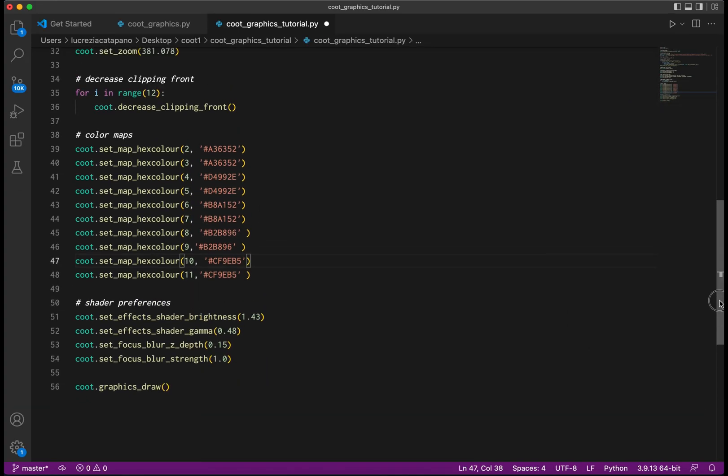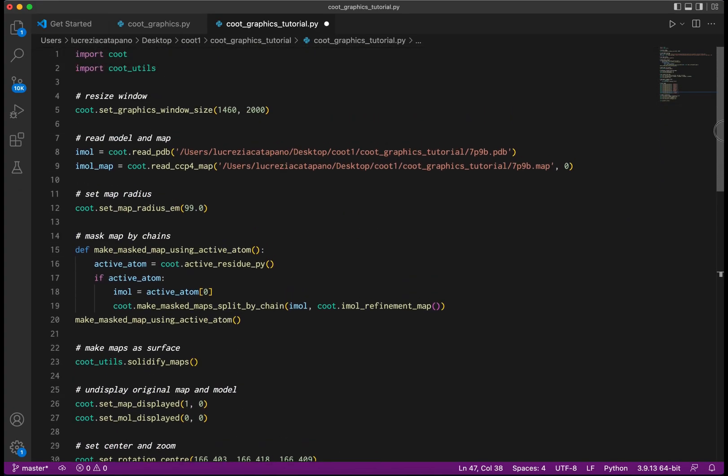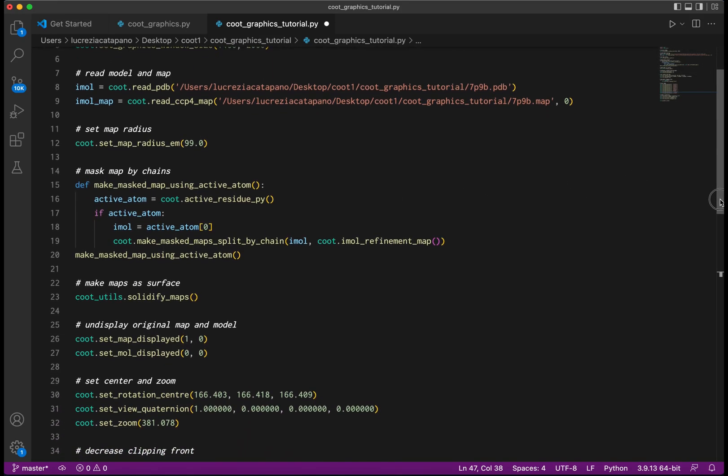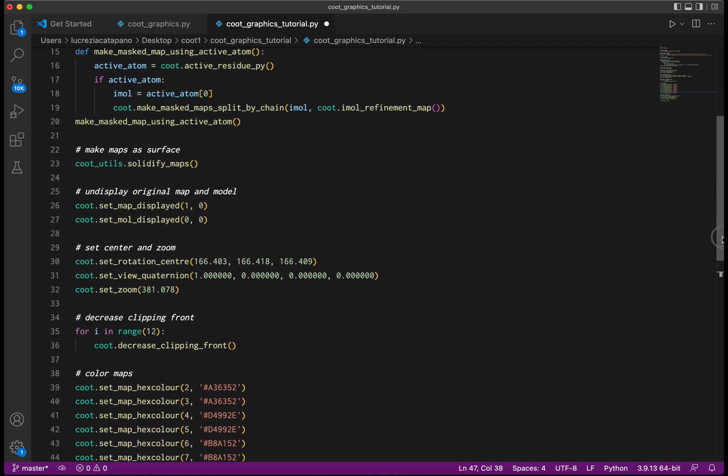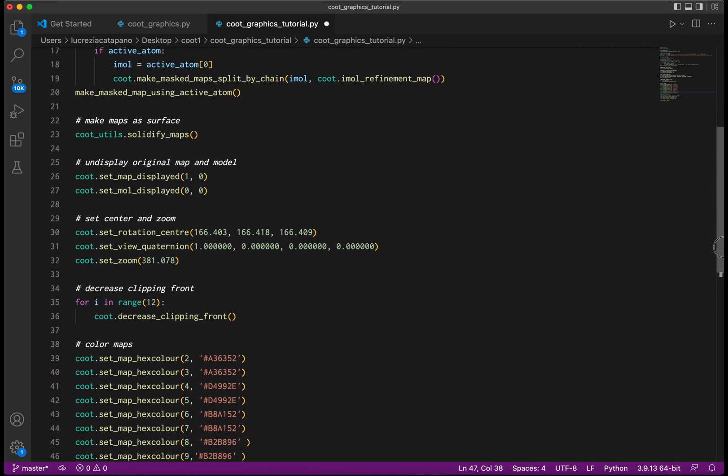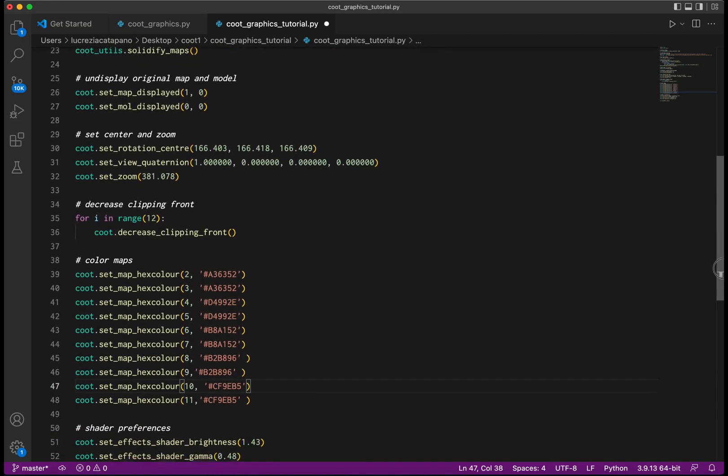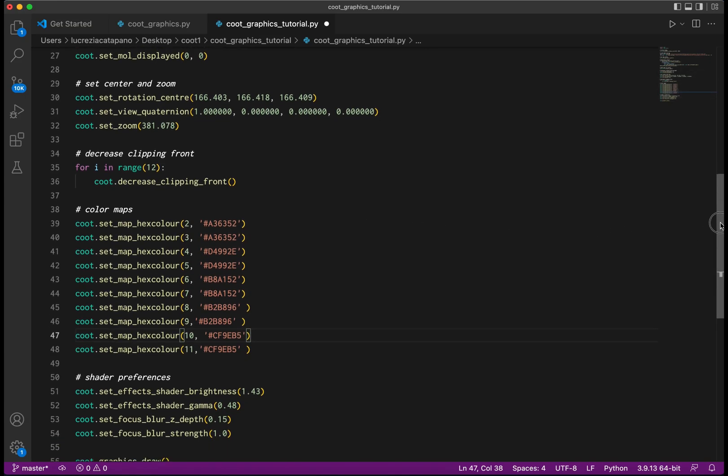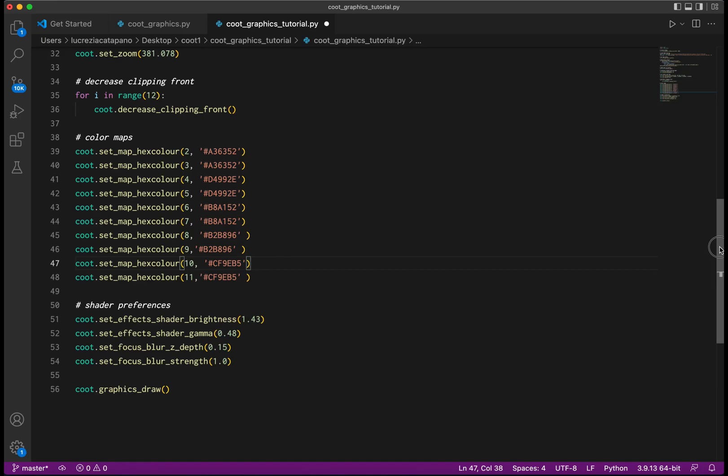All right, so now let's review our code. We imported the necessary Qt modules and loaded the model and the map. We changed the radius of the map to be bigger and split up the map into several new maps, each one corresponding to a particular chain. We made all the maps solid instead of mesh and undisplayed the original map and molecule. We also specified the view with the center, the view rotation quaternion, and the zoom level. Each map got a hand-picked color, then we tweaked the shaders by changing the brightness, the gamma, and the focus.